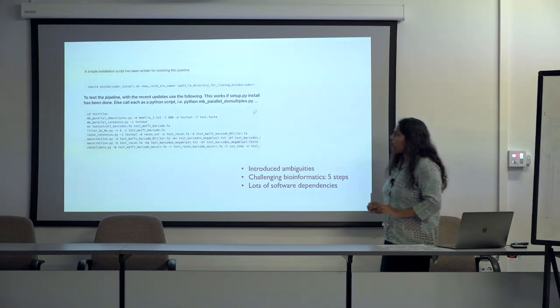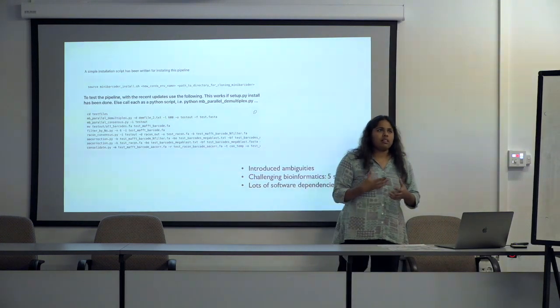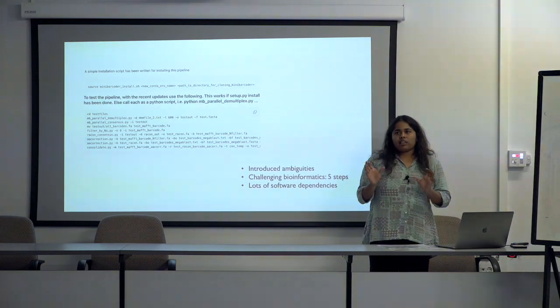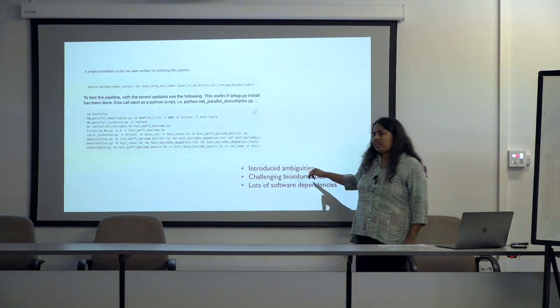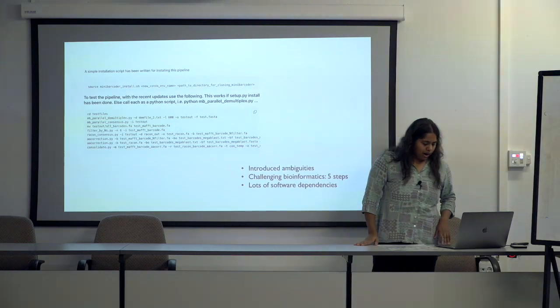The other problem was to account for systematic errors. We used the property that CO1 is a translatable molecule, and because of that, we could gauge where the frame shifts were occurring, and we introduced ambiguities because of that. So this pipeline had the problem that it was including lots of Ns, which is not desirable for your barcodes.